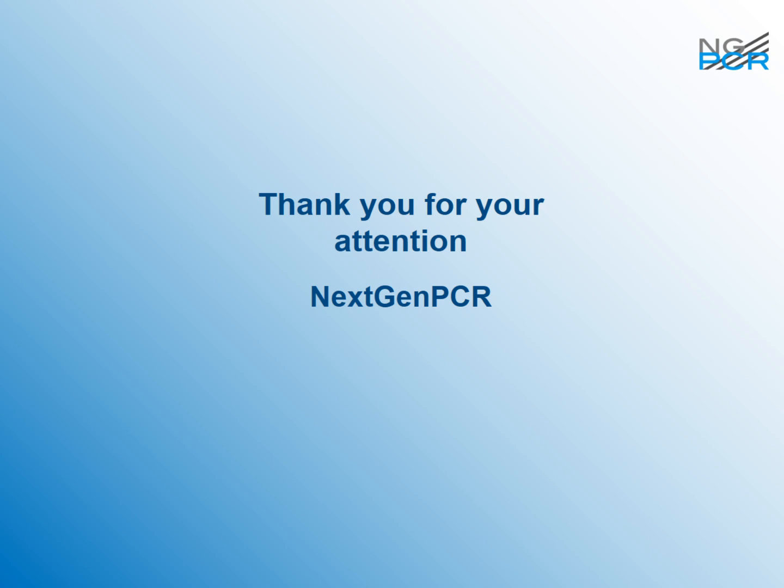And the other one I would like to say something about is, have you tested this with library prep kits for NGS? The answer is yes. We've tried that, not very often, but we've tried it on a few occasions during demos in the United States and in the United Kingdom. And on one occasion, we got a result which was very comparable to a standard cycler. And in the other case, it looked like we got a little bit more specific result. But we are going to do more work on this because we feel that we should be more specific as we change the temperature instantly, and we don't end up with tubes with liquid of many different temperatures. So yeah, that's a very interesting part of the applications for us.